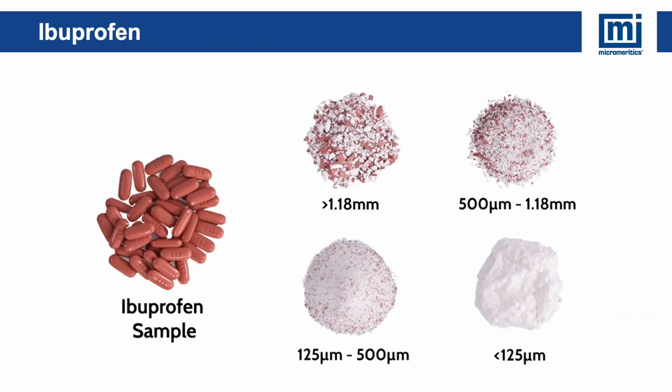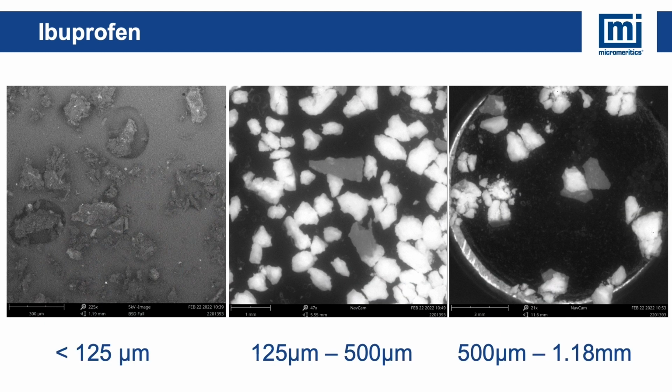The last sample is ibuprofen. The material within the coating is exposed when the sample is ground. Here are the SEM images for the ibuprofen.